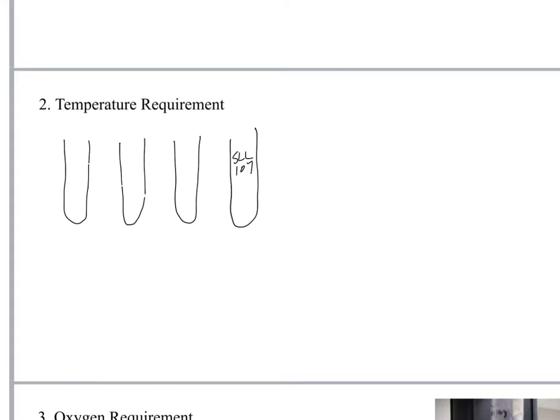So say I'm assigned to Pseudomonas aeruginosa, I can just abbreviate that, that's fine. And you're also going to want to put on those test tubes the temperature that you're going to be incubating them at. Okay, so let's say this is my 55 degrees Celsius tube. Typically when we incubate our organisms, we throw them all in the same rack, but this time you're going to have to pay attention and make sure one tube goes in the 4-degree rack, one in the 22-degree rack, one in our big walk-in incubator, 35, and again this one at 55 degrees Celsius.